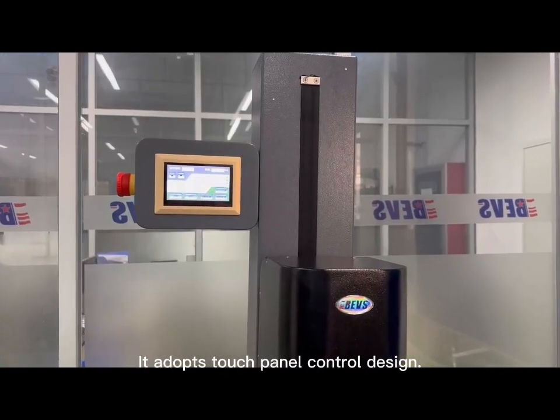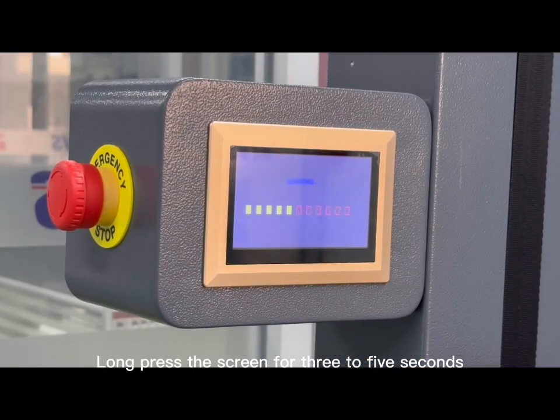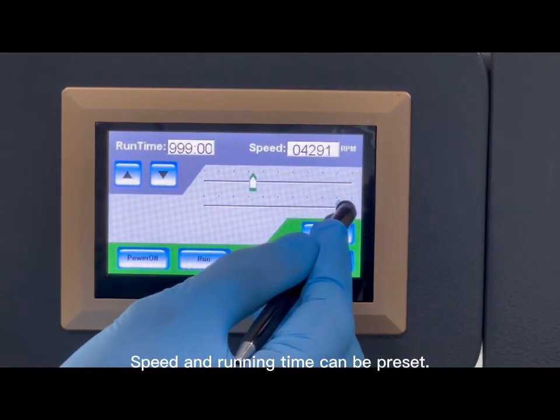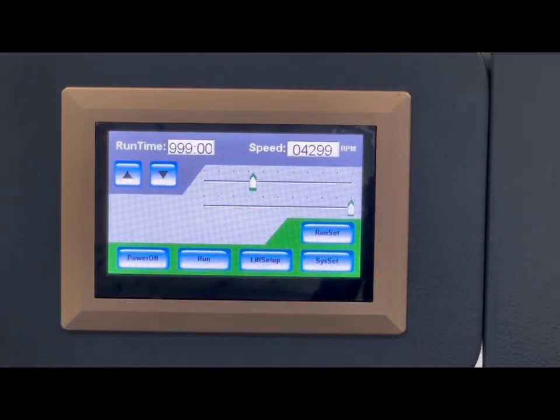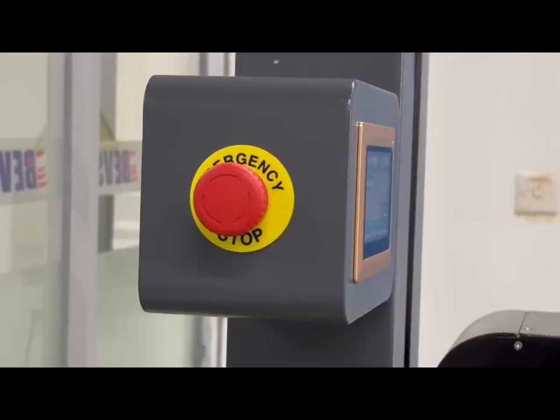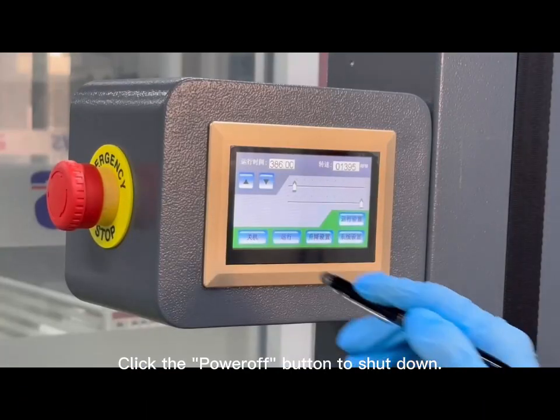It adopts touch panel control design. Long press the screen for 3 to 5 seconds to boot up the mixer. Speed and running time can be preset. Stop at any time while running. Emergency stop switch for safety. Click the power off button to shut down.